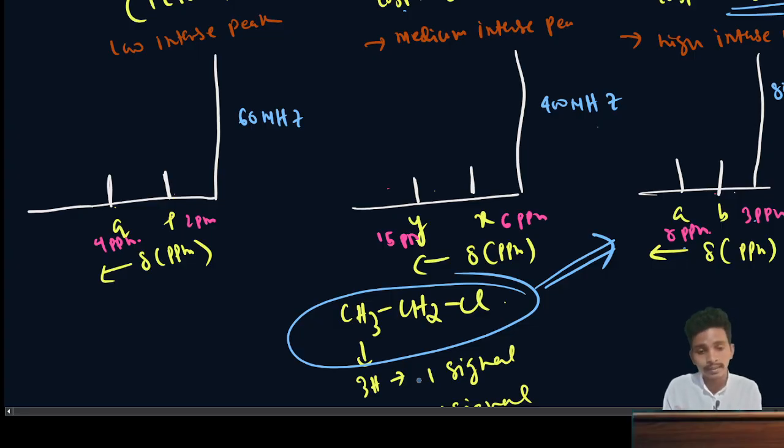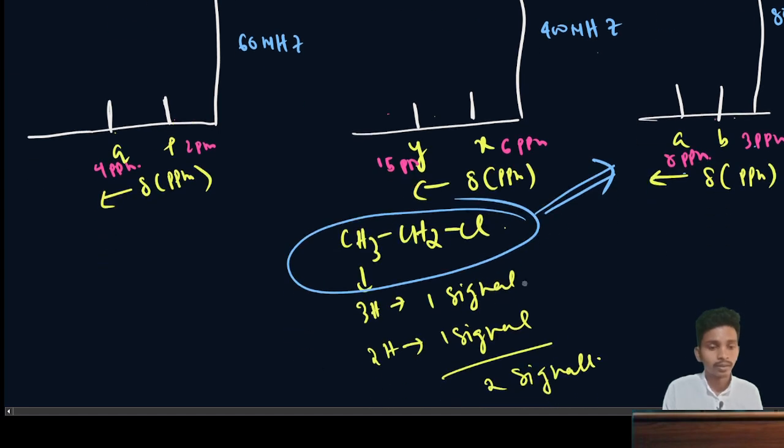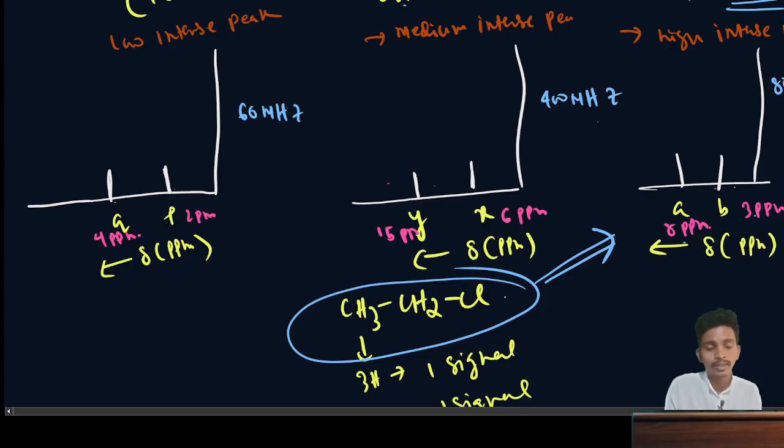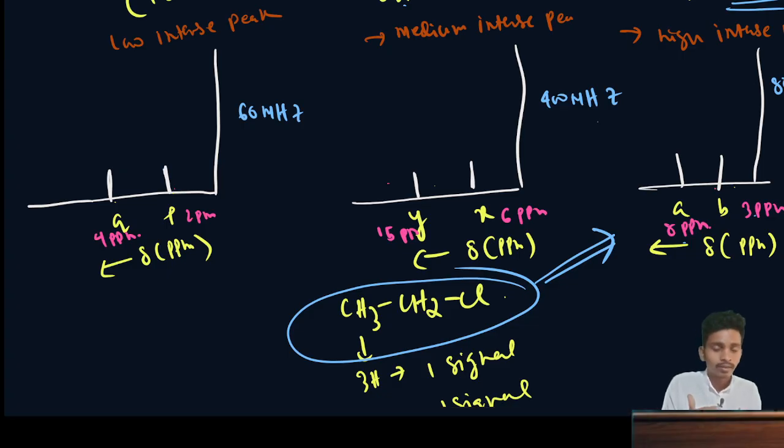So it is very tough to characterize a molecule. Some lab will say this molecule has this chemical shift, somebody says another shift. So to normalize the chemical shift values, so that every lab gets the same chemical shift even if they are using different magnitude instruments, they get the same peak. For that they use a standard reference, which normalizes the peak and gives the same peak.